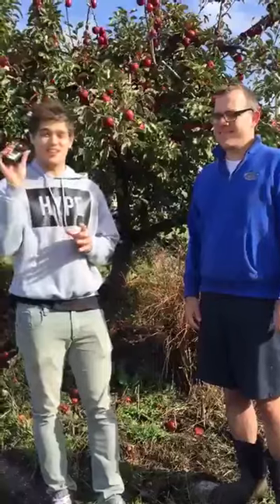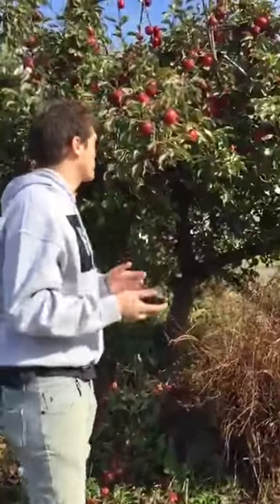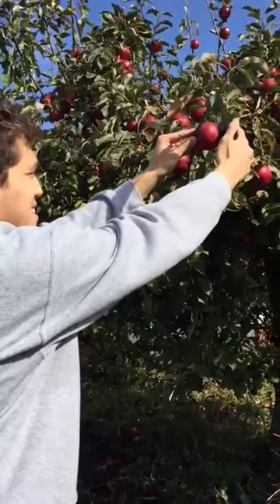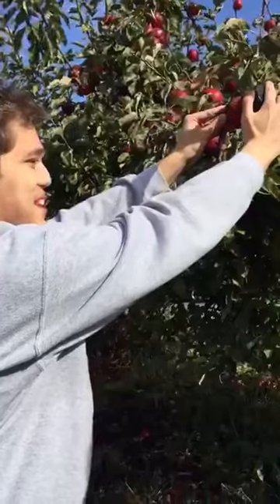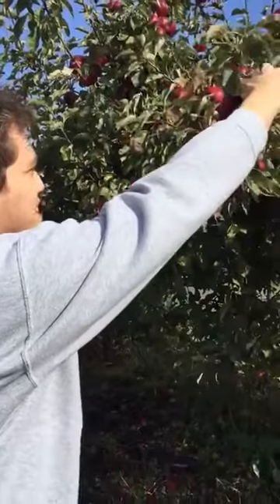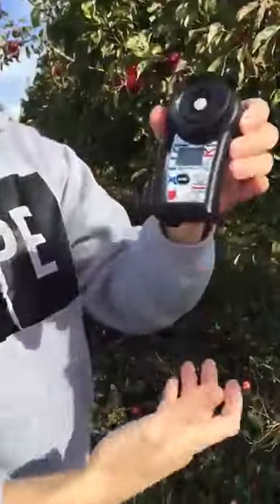With this one you can actually measure the sugar level or the consistency of your apples by just doing this — pressing start — and you get a measurement.